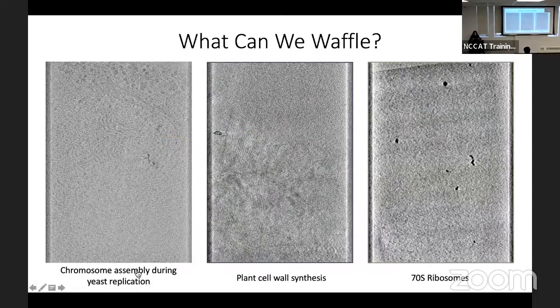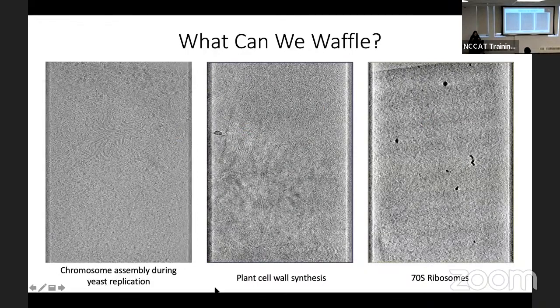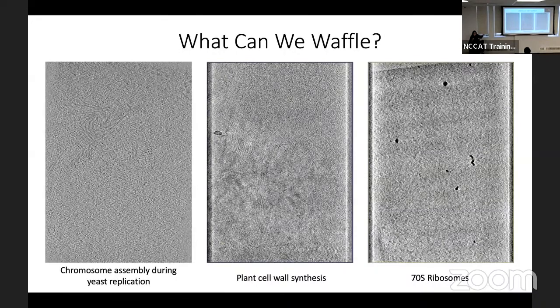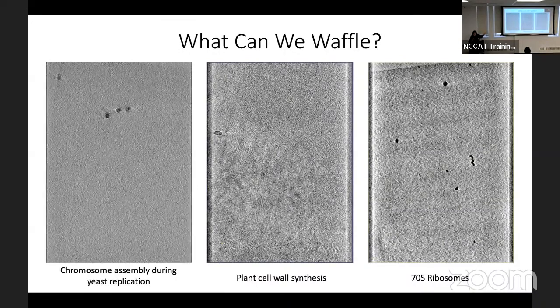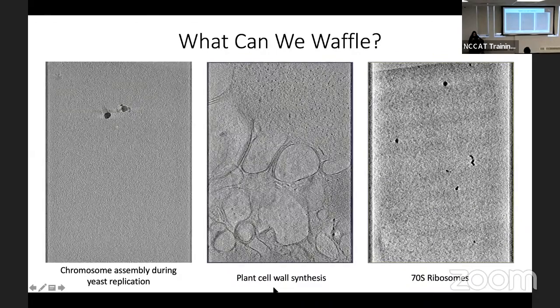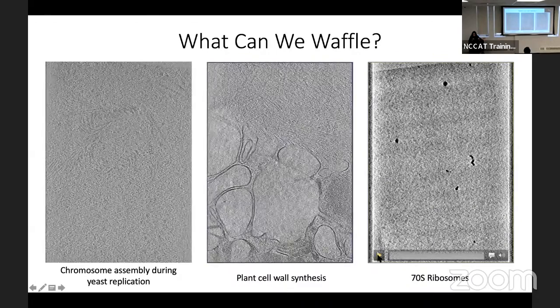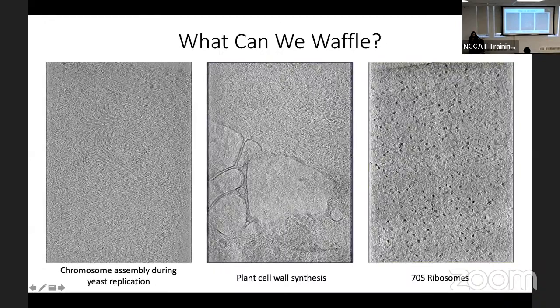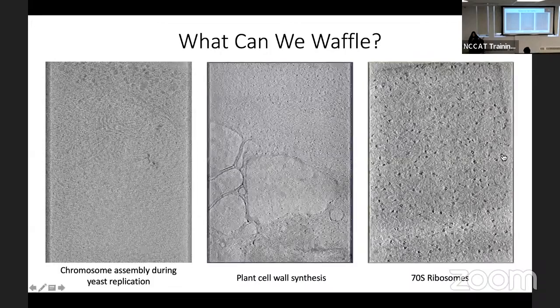Okay, what can we waffle? I just have some videos here. This is yeast, obviously, and some chromosome assembly during yeast replication. We've done plant cells. This is plant cell wall synthesis. And this is an example of purified protein, which is just 70S ribosomes. So it is possible to do this with protein.